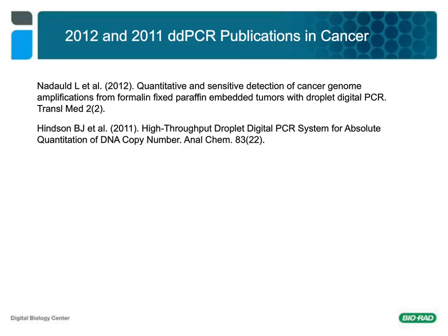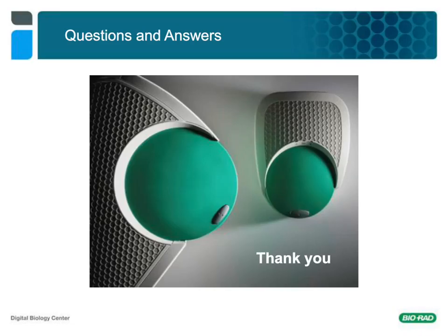Maybe guess is not a great term, but you could back calculate, based on the dynamics of amplification, how much your starting material was. And truthfully, with digital PCR, since you're putting a single template in a single partitioned droplet and that reads as a positive, you are counting the number of molecules that you started with.